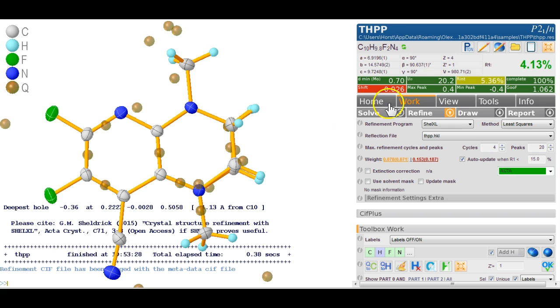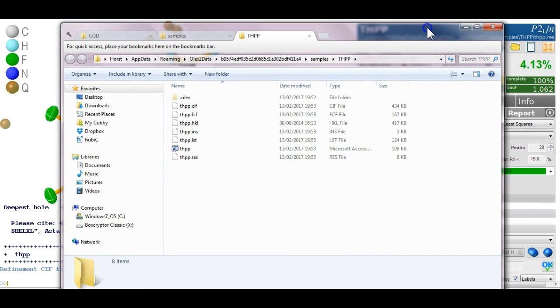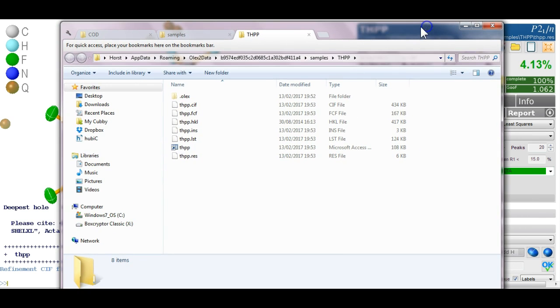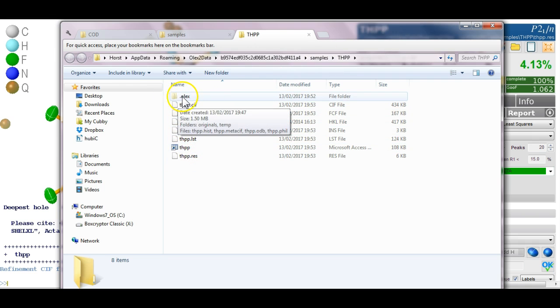So first of all if you click on this folder symbol here then you see the current working folder where everything happens. So we've got the files relevant to the structure here and we've got a hidden folder dot Olex. So you might not see this if you have hidden files hidden in your computer system.